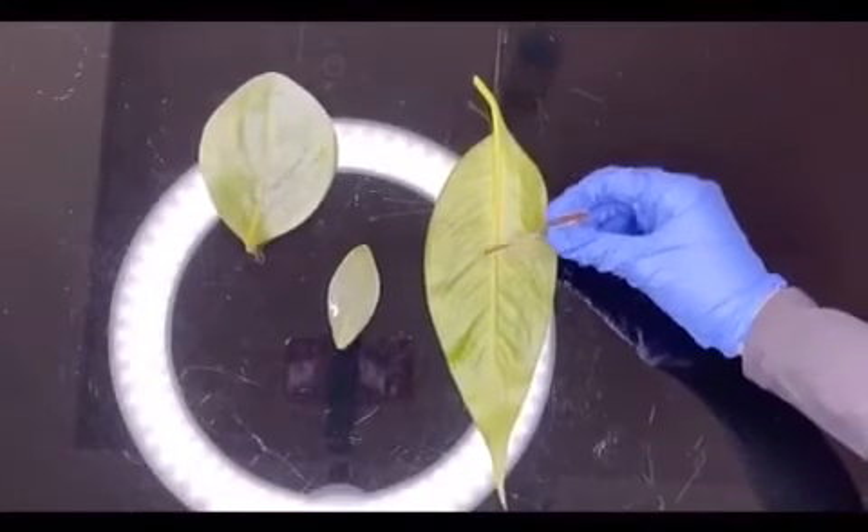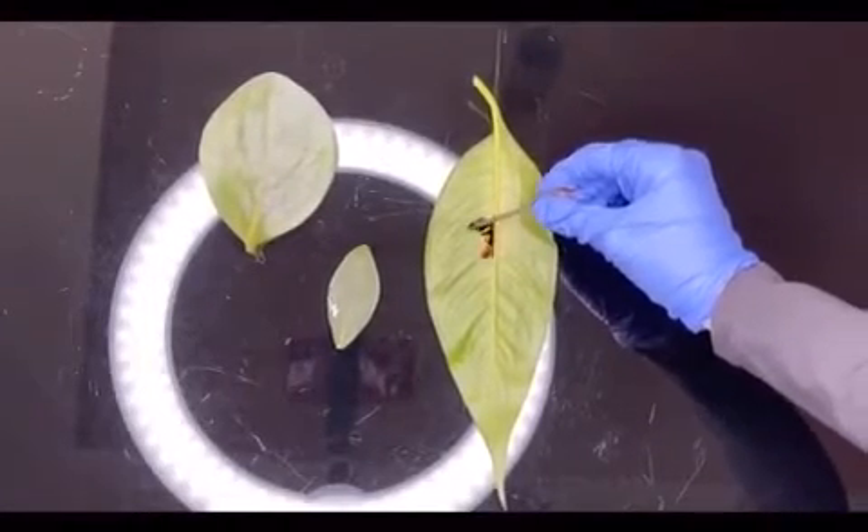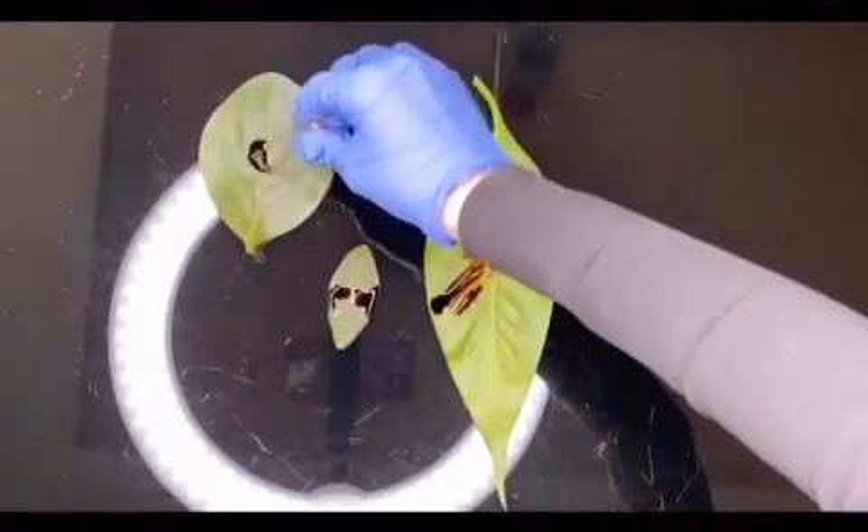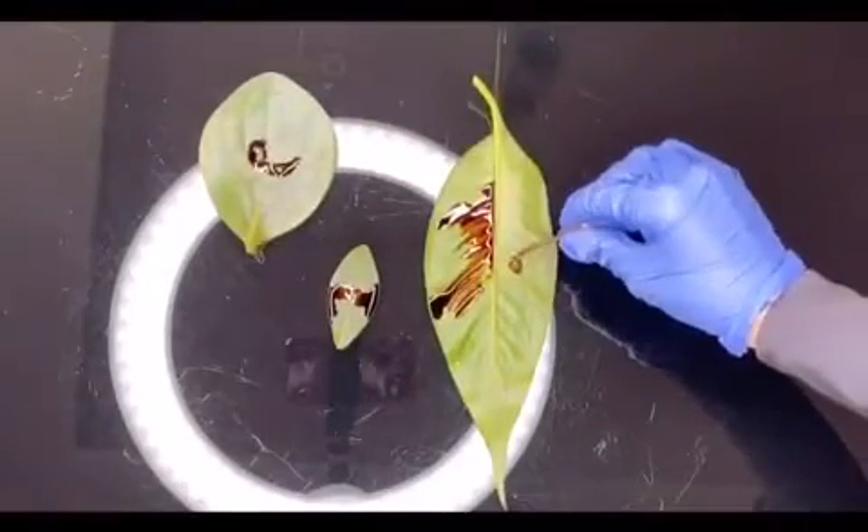Lastly, with a pipette I will add a few drops of iodine solution, and hopefully the leaf will turn blue-black — and if so, my prediction will be correct. To show how much starch different leaves have, I have done the experiment on three different leaves.